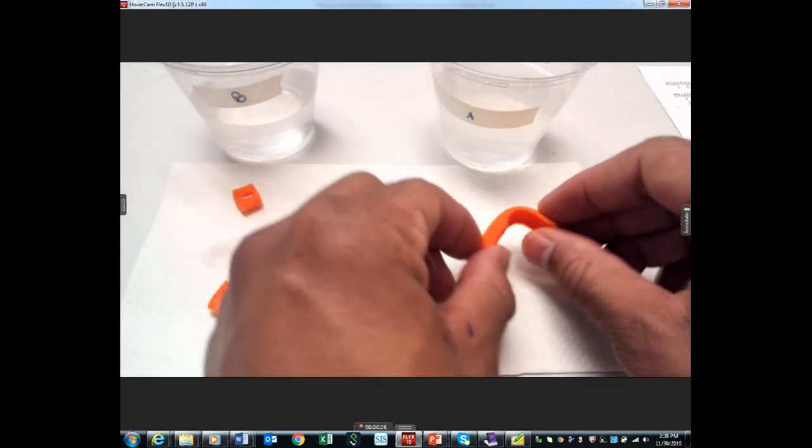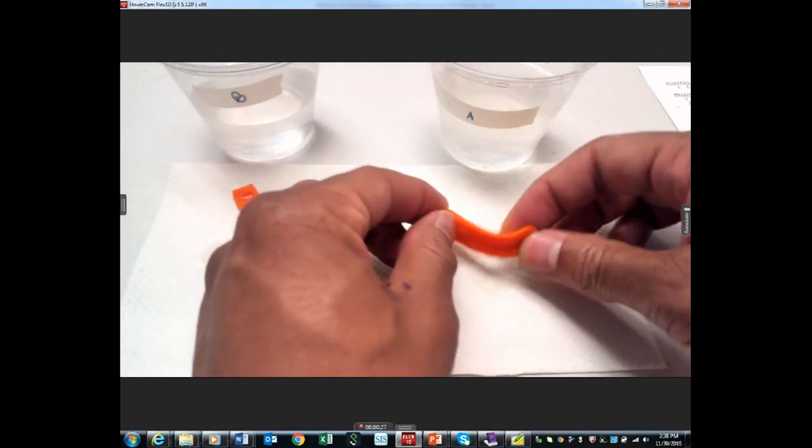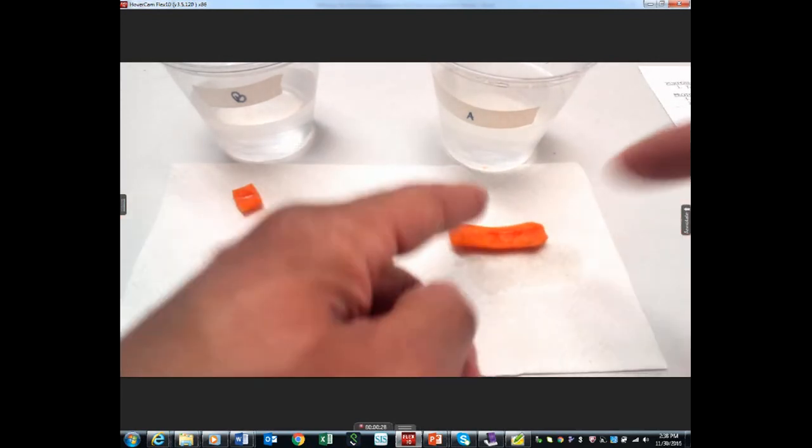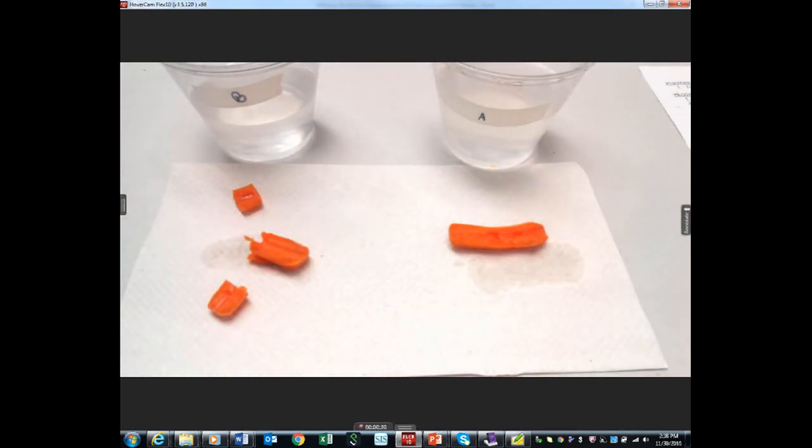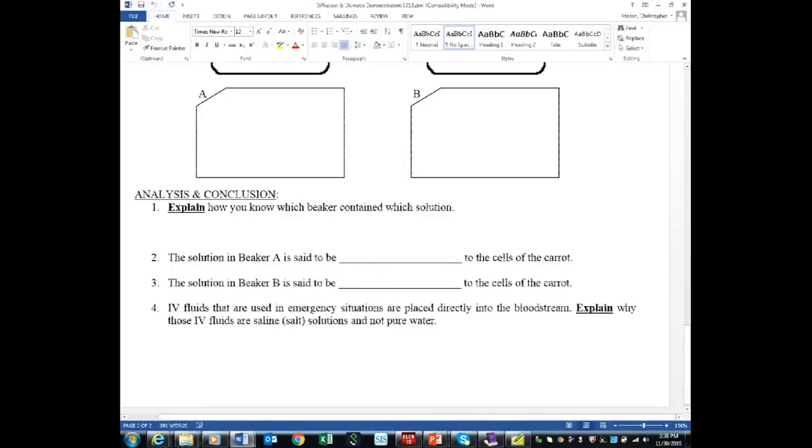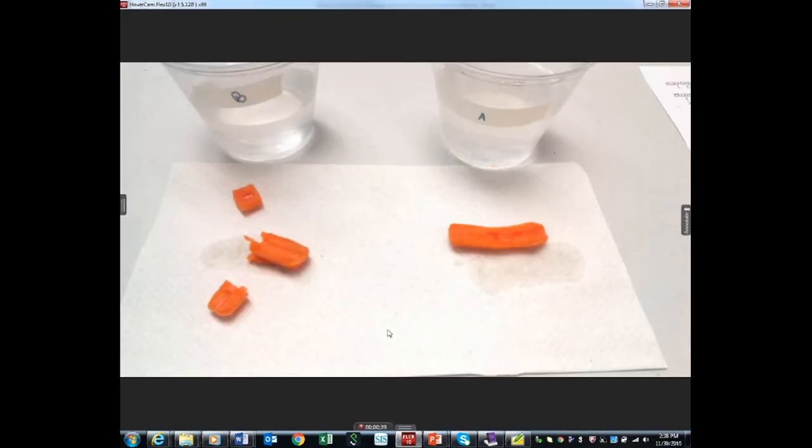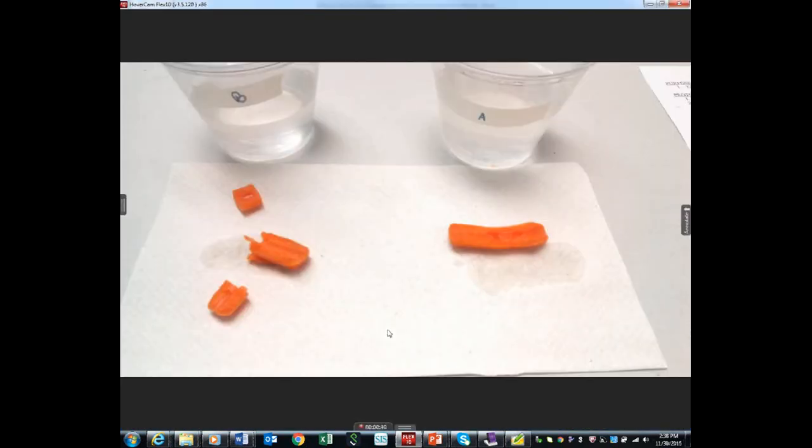Here's A - look, feel it. It's lost water. A is salt water, that means A is, as you should write in here, hypertonic. And B is hypotonic.